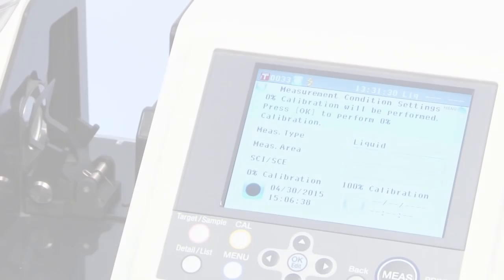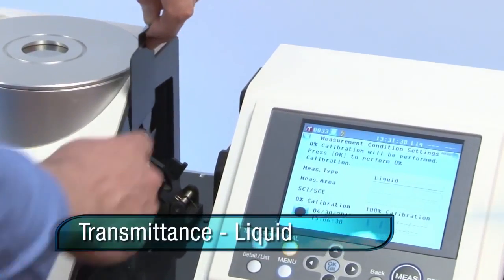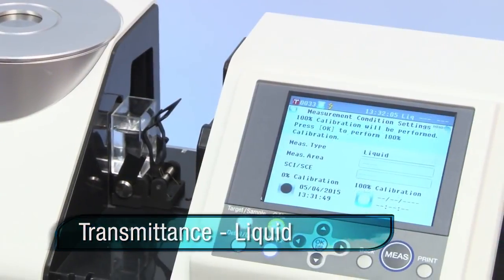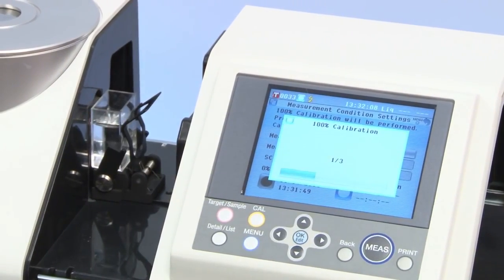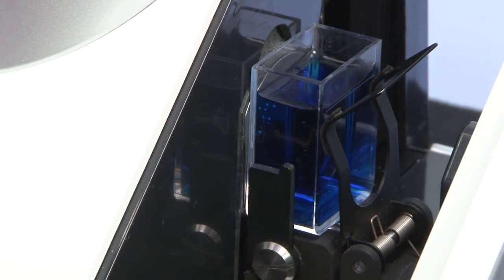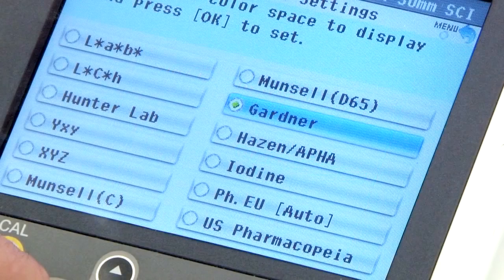The liquid mode will guide you through proper sample preparation, which includes zero calibration inside the transmittance chamber, as well as a simultaneous white calibration, clear water, and cell holder calibration procedure before measurement. In addition to classic colorimetric evaluation systems, the CM5 liquid measurements are evaluated in terms of industry-specific indices.